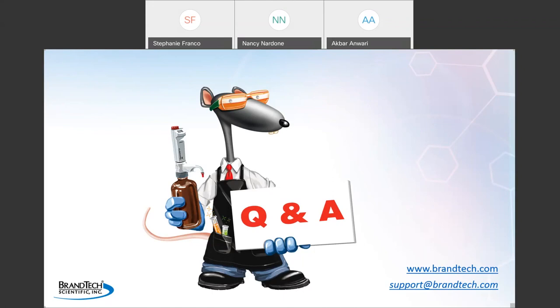Okay, we have time for a few more questions. Is organic liquid measurement by a pipettor as accurate as measurement for water? Can you say that again, please? Is organic liquid measurement by a pipettor as accurate as measurement using water? I'm not exactly sure what is meant by that. I guess I'll just go back to water. The standard per ISO 8655 for calibrating a liquid instrument is the gravimetric method using water, and the water should be distilled or deionized water.